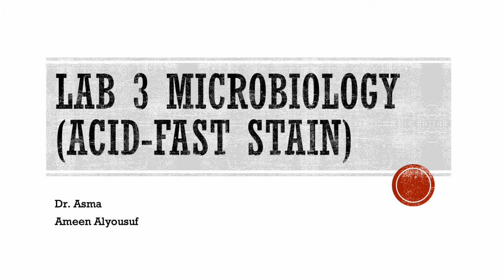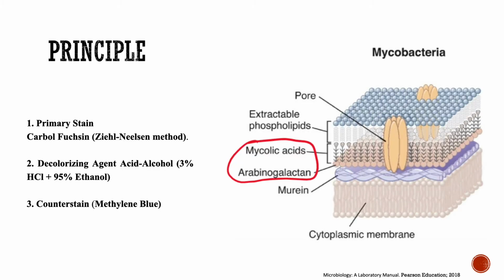Good morning, everyone. So today our lab is lab 3 of microbiology, and it will be about the acid-fast stain and the mycobacteria. So what is the principle of this procedure, or this lab, about the acid-fast stain?